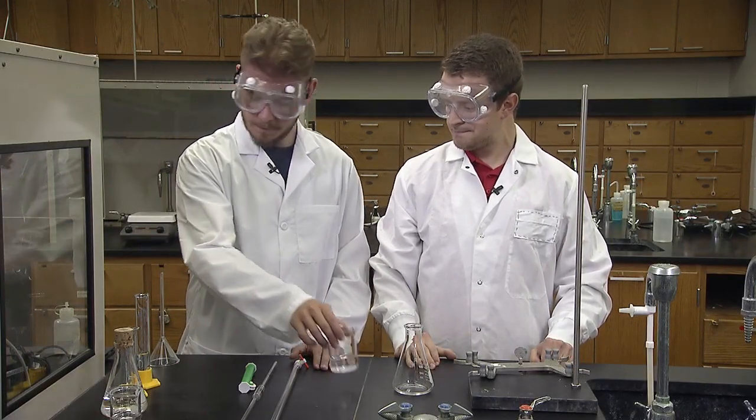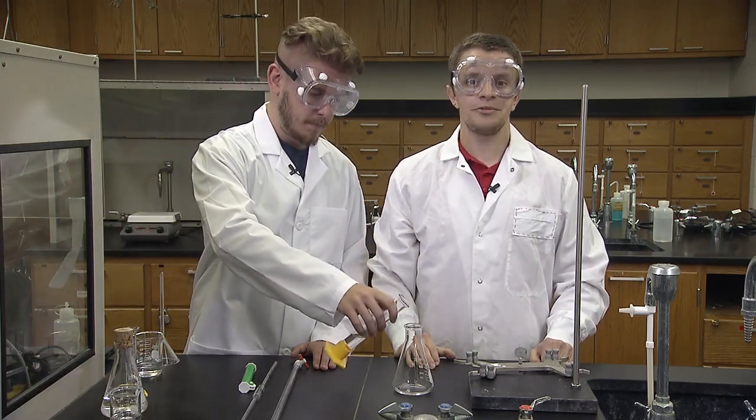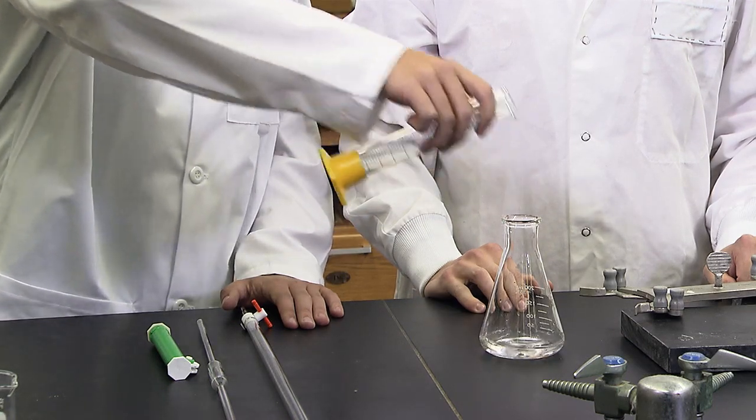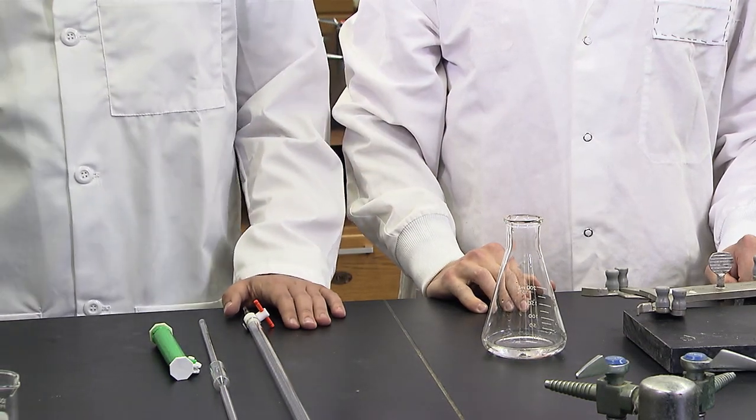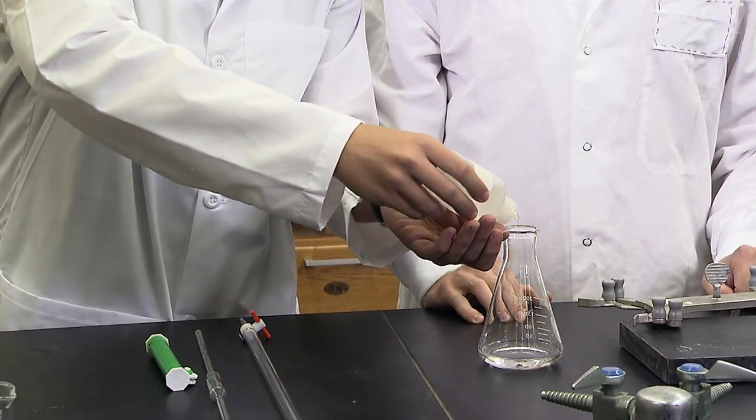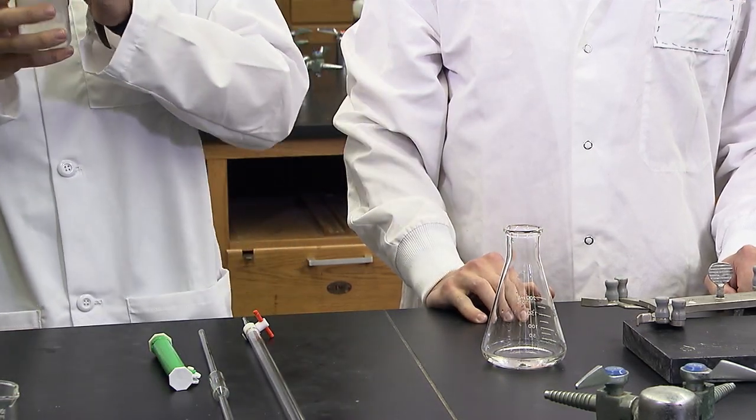Remember, never pipette out of the stock bottle. Add 20 milliliters of DI water and a couple drops of indicator. This flask is now ready for the experiment. You will prepare two more flasks like this later in the lab. We'll set this flask out of the way while we prepare the burette.